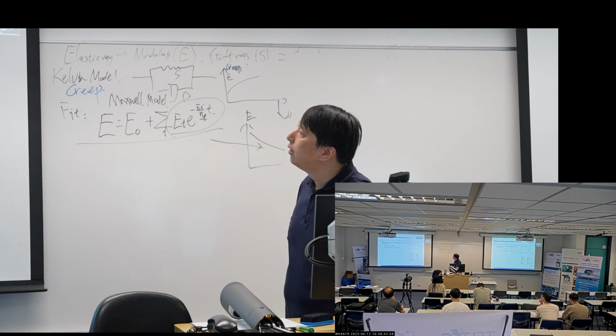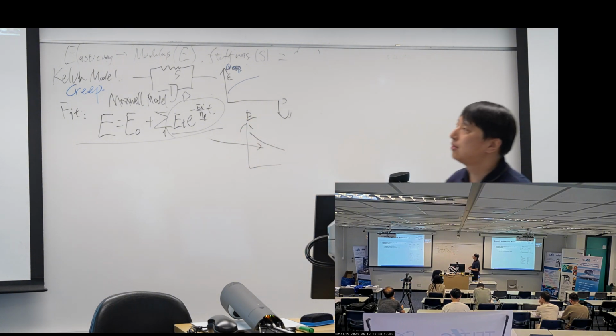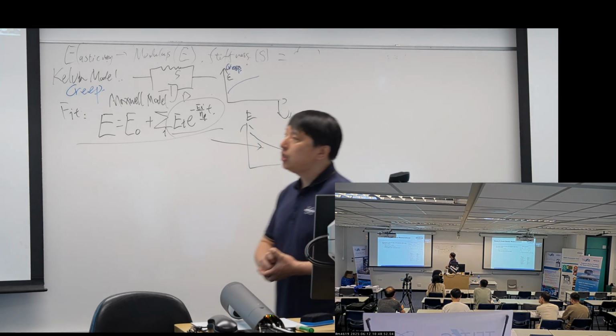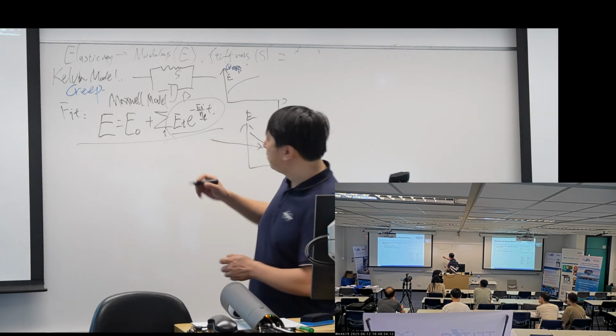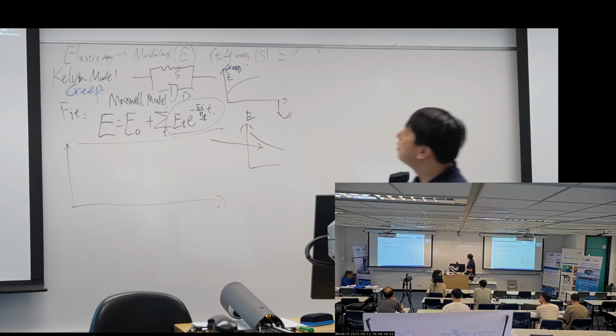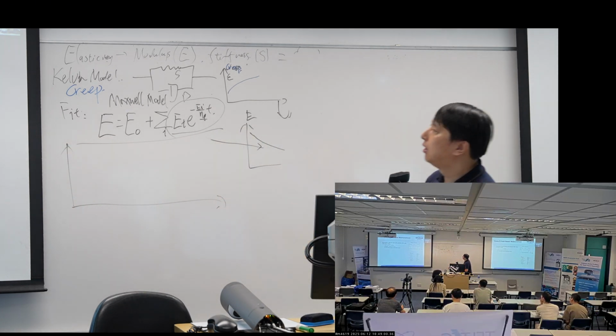Oh yeah. Let's start with the relaxation. The relaxation is similar to what Maxwell described.